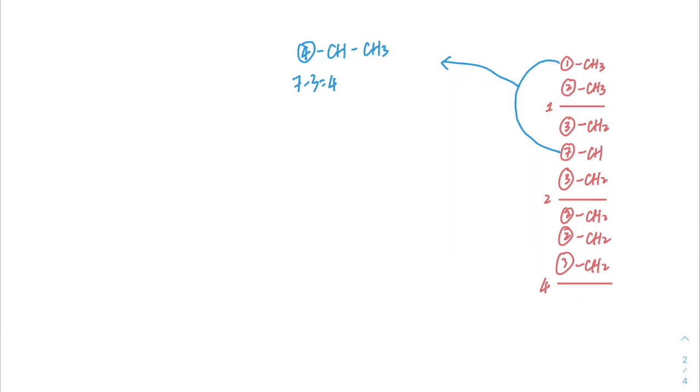So I only need 4 more hydrogen neighbors. And we also know 4 equals 2 plus 2 and 3 plus 1. Since we don't have any CH in the group anymore, that wipes out this possibility. It has to be 2 CH2. So let's change this 4 into 2 CH2.